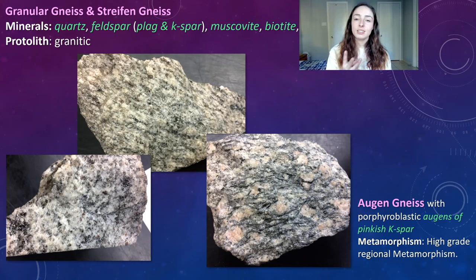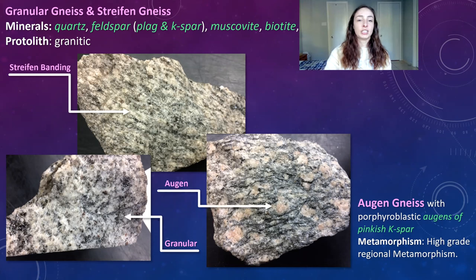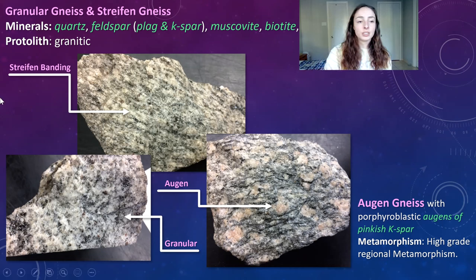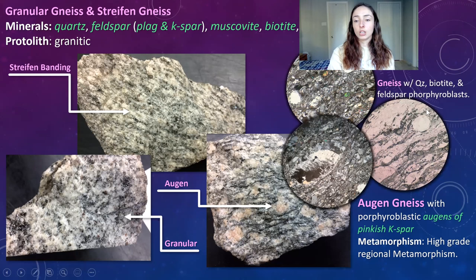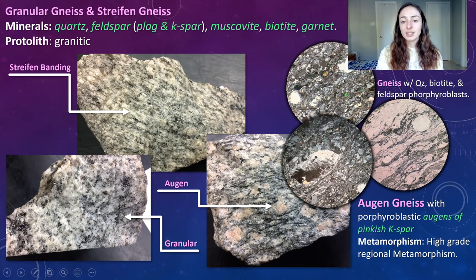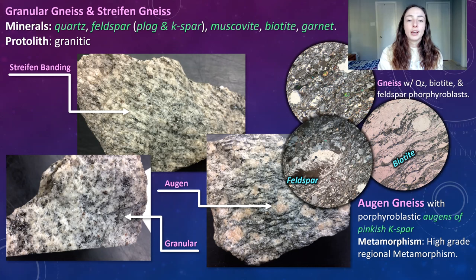Next we have gneiss. There are three major types I'll talk about: granular gneiss, streifen gneiss, and augen gneiss. Granular gneiss doesn't have any preferred orientation of mineral grain or banding. Streifen gneiss has streifen banding. Augen gneiss has banding but also clasts that stand out among the banding, with the banding curving around them — we can see that better in thin section. In thin section you can see the augens, such as a clast of quartz in plane polarized light and cross-polars, with banding of likely biotite below, and a feldspar augein with quartz surrounding it. Gneisses typically form under high-grade regional metamorphism with a granite protolith.